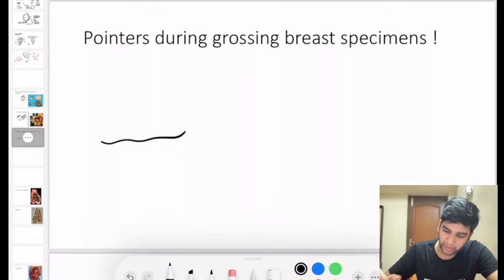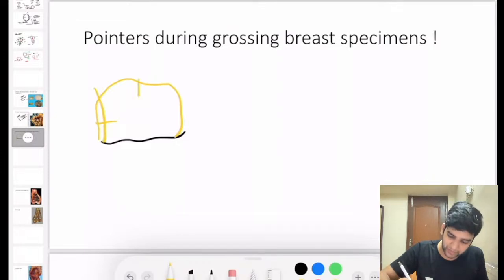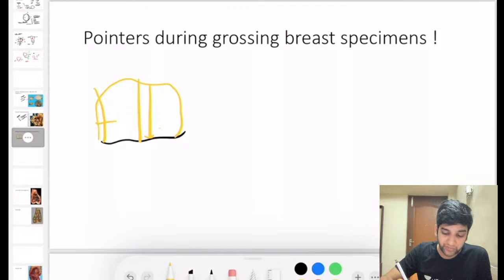Let's assume this is skin and I have a breast mass till this. We'll cut this and then we'll leave it a little bit because the knife is not strong enough. Don't do that. You have to cut from here till here. You should go till the skin. Once you reach the skin, it's fine, because most of the time the tiny lesions which are in the subareolar, subskin space are being missed. Don't do that. In a retrospective study in our college, we found that quite a significant number of lesions in this location are missed unless it has been mentioned pre-operatively. Please cut till the edge, right?